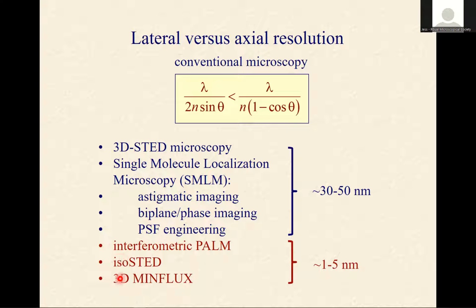But I mean, they are marvelous techniques, but they are super challenging from a technological point of view. So not many people have them available, and they are really difficult to operate. So we were thinking maybe to come to some simpler ideas, but before coming to that, I want simply to mention that, of course, one big challenge also to these methods here is something which we call spherical aberration.